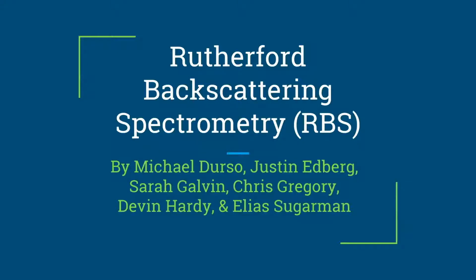Rutherford Backscattering Spectrometry, RBS, by Michael Durso, Justin Edberg, Sarah Galvin, Chris Gregory, Devin Hardy, and Elias Sugarman.